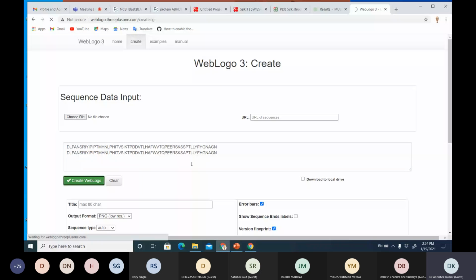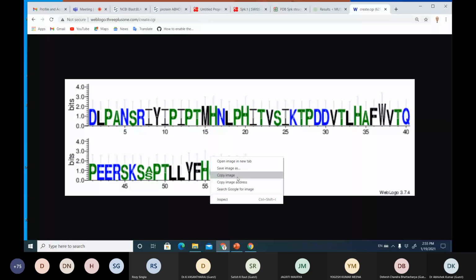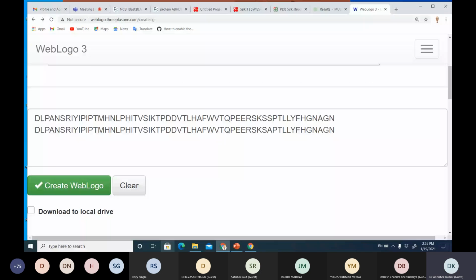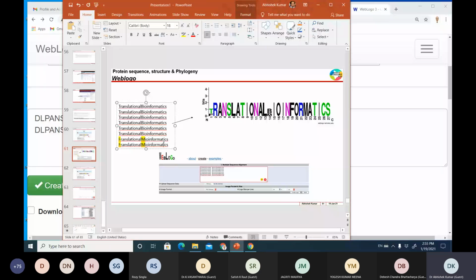Okay, it actually created it, and it created it for most of them. Most of the positions are very big, and only one position has a change. That was quite obvious. And then one can take this to wherever you want to present. Let me take you to the example which I have taken in the figure, which you normally take. So we just take this. You can play with your own name also and create a logo.